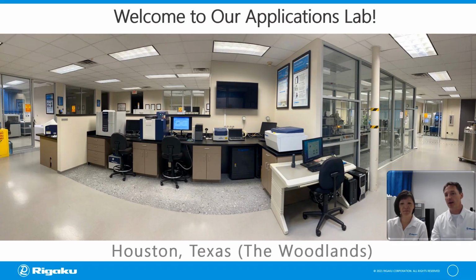Welcome to our workshop. We're going to be talking about how to do a quantitative XRF method for pharmaceutical analyses.